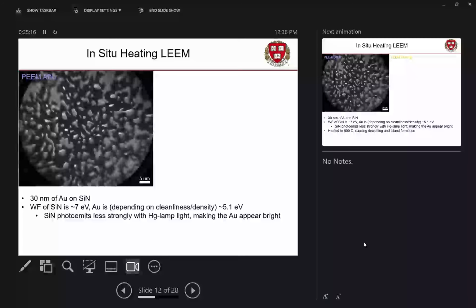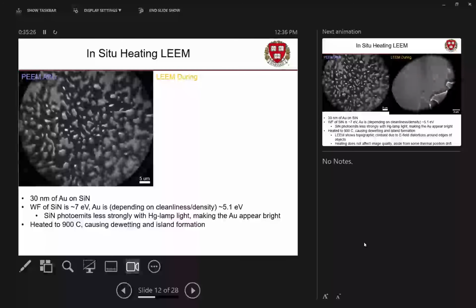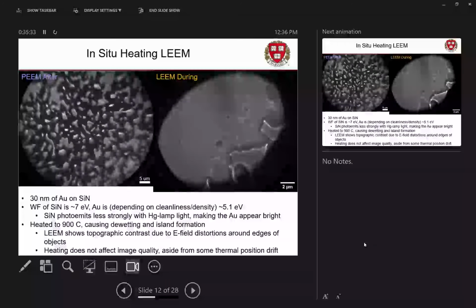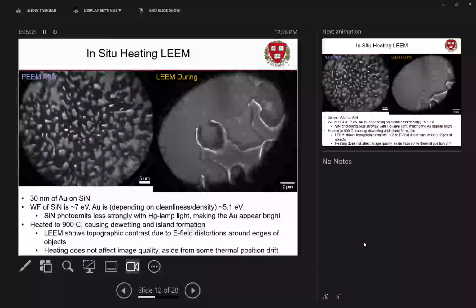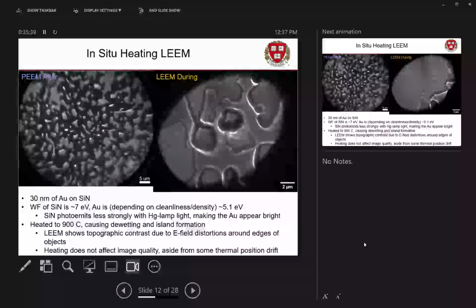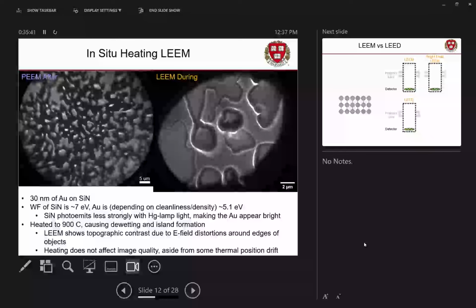Instead, it becomes mobile and starts moving around, and it clusters up into little droplets and forms these islands. So, a very, very simple materials science, surface science experiment: de-wetting of gold. Okay, cool. But we can watch it happen in real time. So this is a LEEM video of this actually happening. This is the original gold film. And this is where it has gotten sucked away and is starting to cluster up and make droplets.